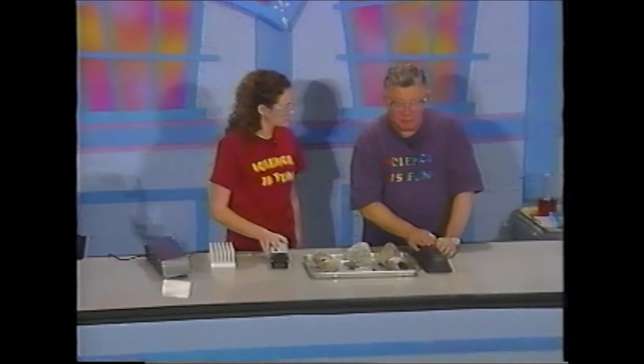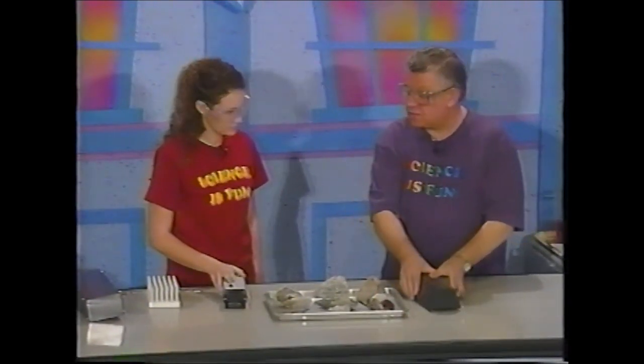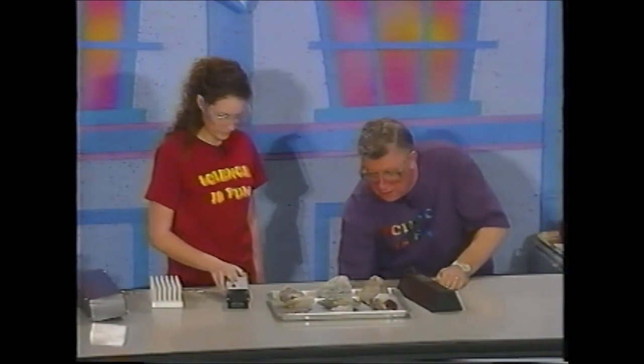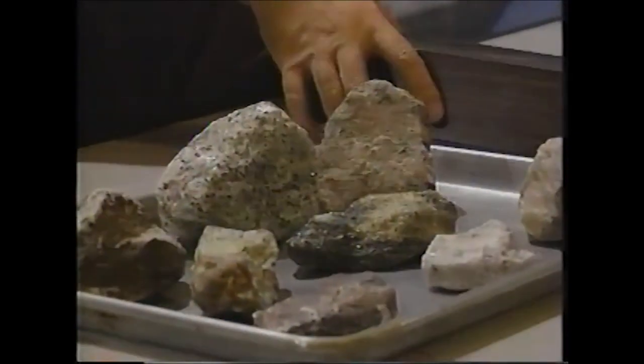Mine is a long wave UV lamp, what we call a black light, and yours is a short wave UV lamp. So let me turn the switch on here, and if we may have the lights down, please, then let me pass the long wave UV lamp, and now you can see why I say the rocks are really interesting, because they're exhibiting a phenomenon we call fluorescence. And this is one way of finding out the identity of the various minerals that we have.